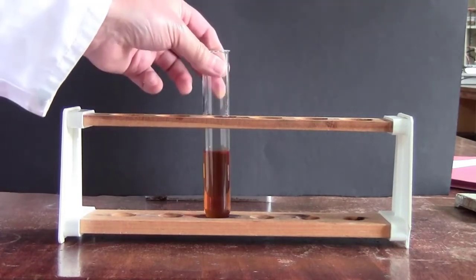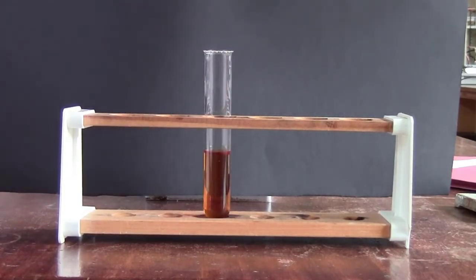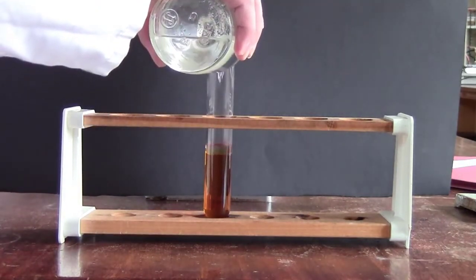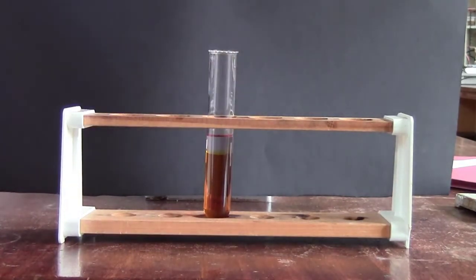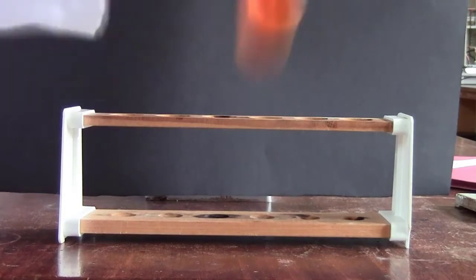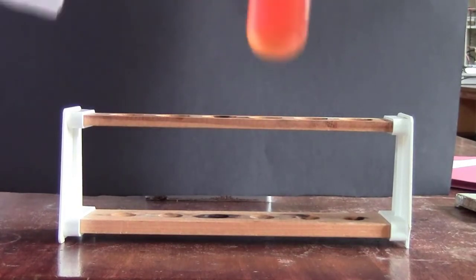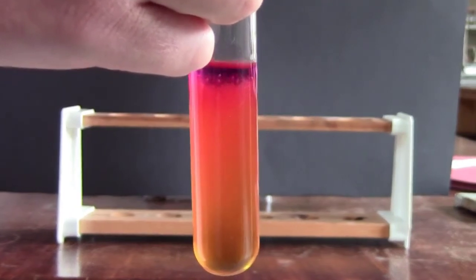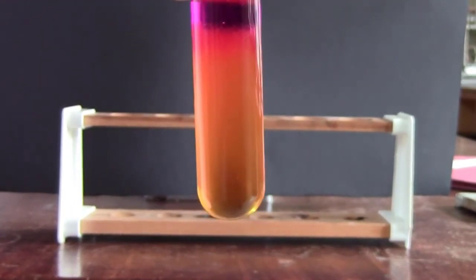To demonstrate that the iodide ions have been oxidised to iodine, we can add some hexane to it. If we shake the tube, we can see that the purple colour goes into the hexane layer as before.